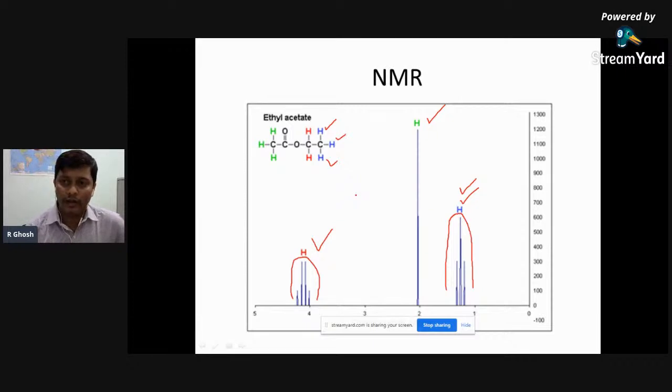So all these analytical tools we can utilize for the characterization of our natural product. Once we have been able to isolate one single component and purify it with the help of chromatography methods, we can characterize these molecules with the help of the spectral data. So we utilize IR, NMR, mass, and X-ray together. The utilization of HPLC, column, and TLC all play a vital role in the characterization of any particular molecule present in a medicinal plant.